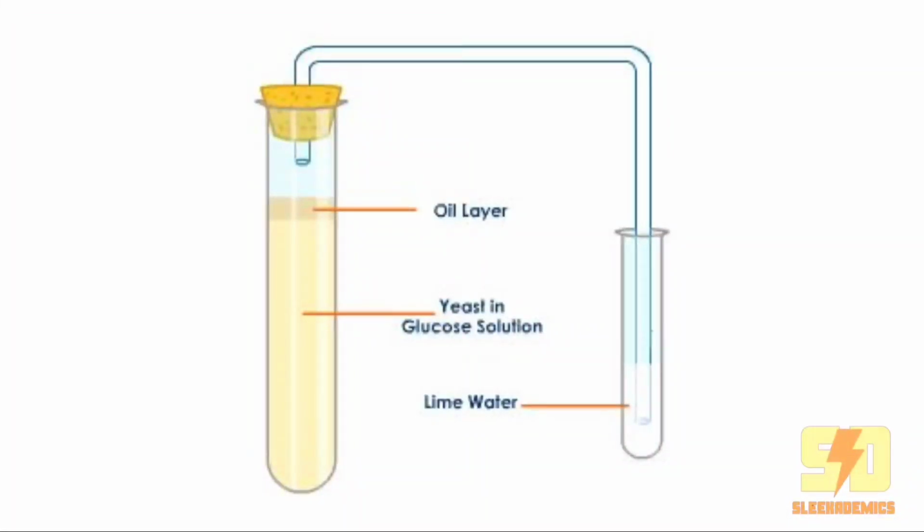a few materials such as glucose solution, yeast itself, liquid paraffin or cooking oil, a vacuum flask, but in this case a test tube can serve, and pipettes.